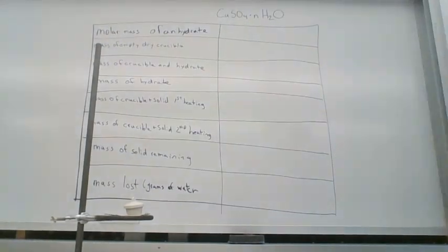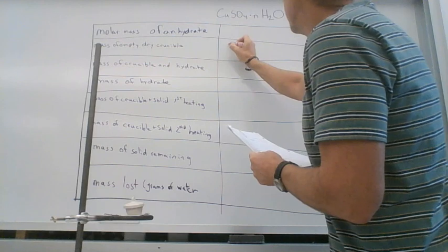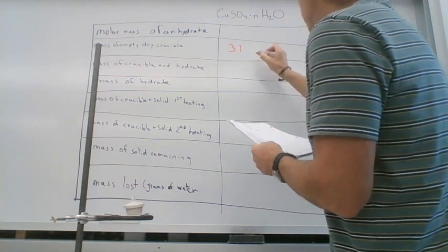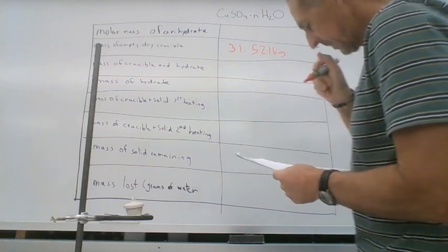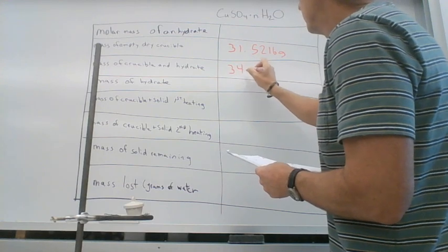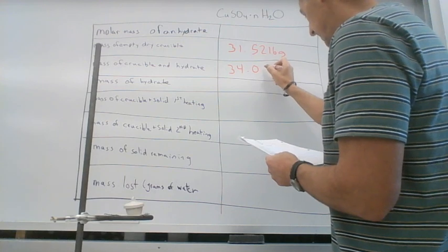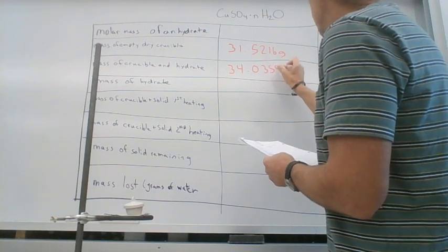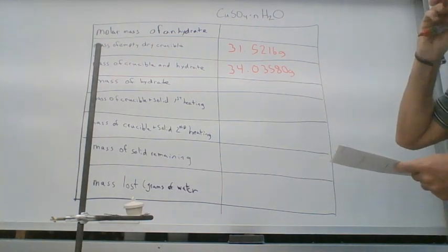And that data will already be on Canvas for you. But if you want to record it as part of this video, then the mass of the dry empty crucible was 31.5216 grams. After I added the hydrate to it and reweighed it again, the mass of the crucible plus the hydrate turned out to be 34.03580 grams. The difference will be the mass of how much hydrate is in there.